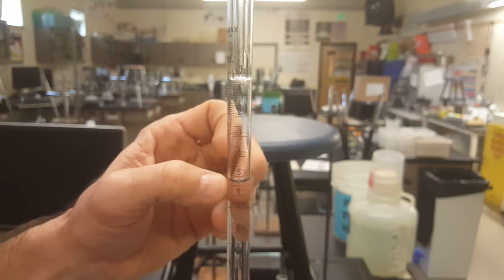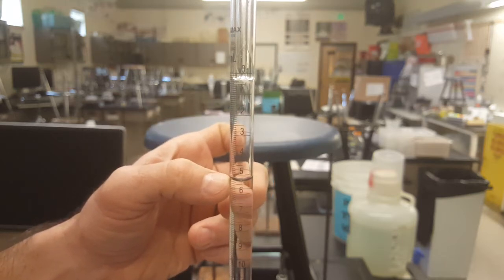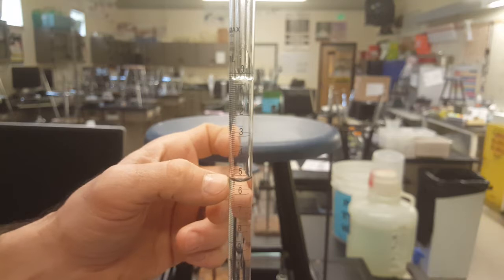I read this value as 5.42, and I'll write that number down so that we can demonstrate using it later. 5.42 milliliters is my initial volume.